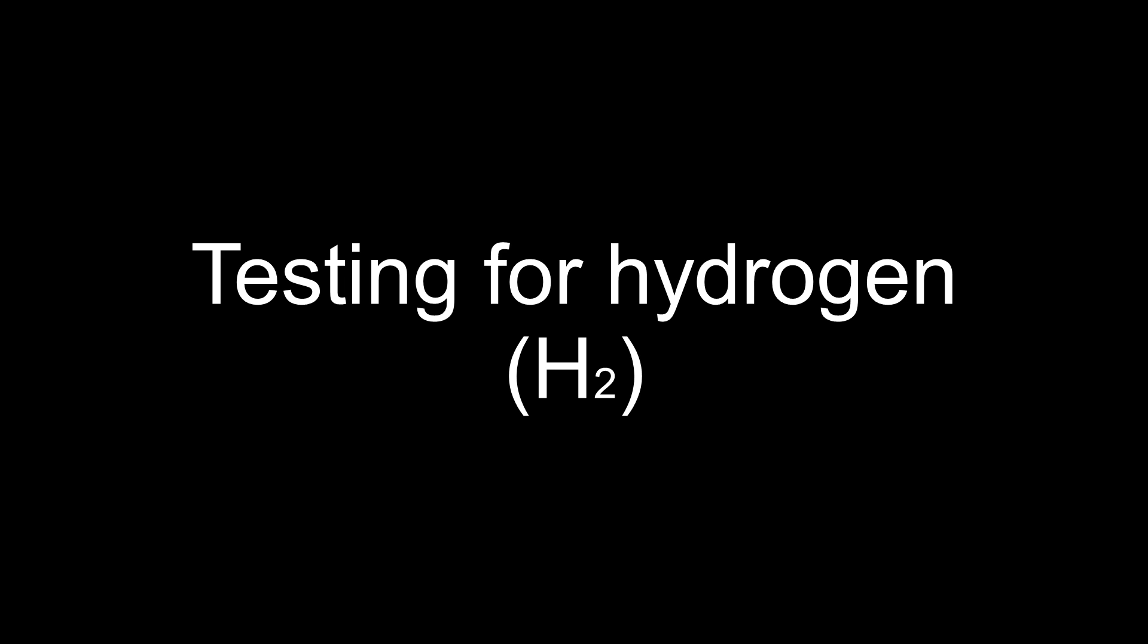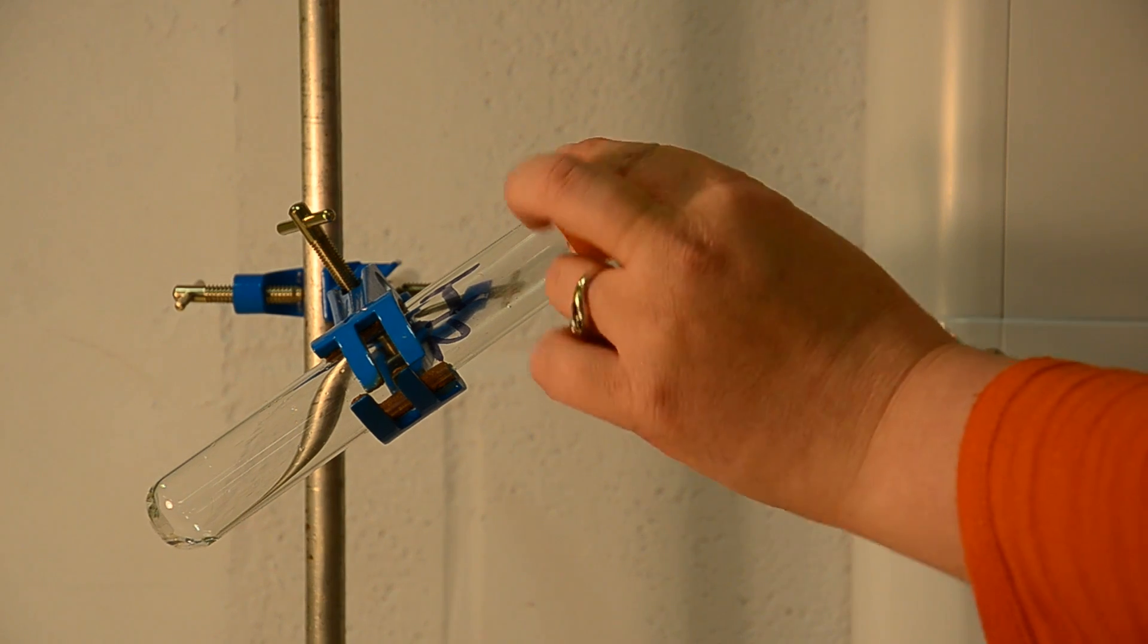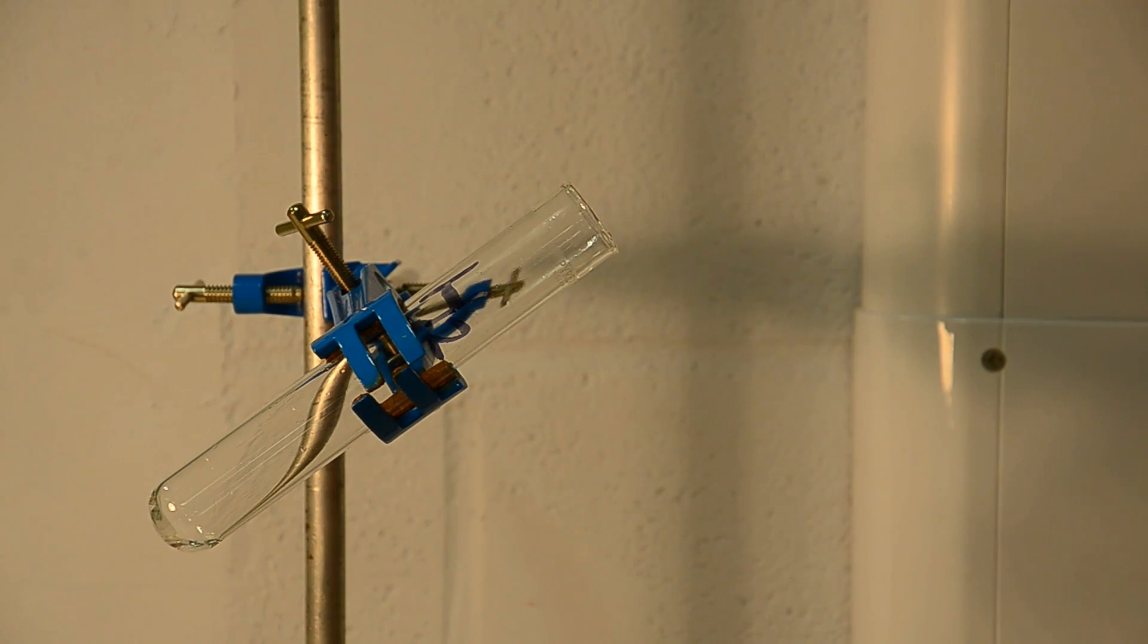The third test is that for hydrogen. Here I've got a lit splint—it's not glowing, it's still burning—and I have a tube of hydrogen gas. Hydrogen is very explosive as you can hear, and you would say that gas has produced a squeaky pop.